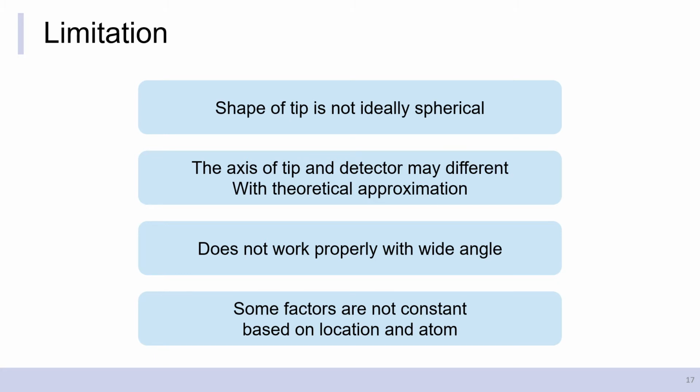Because this method is the most fundamental method, it has some limitations. To deal with this, several researchers developed some methods to correct these limitations. In actual APT, pre-programmed software reconstructs data into 3D.